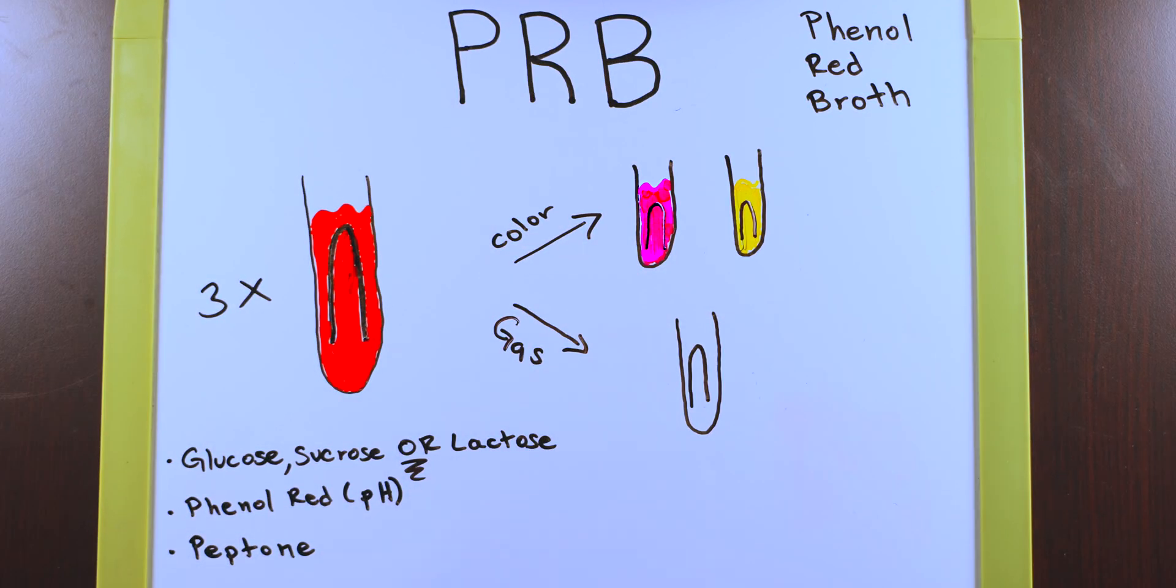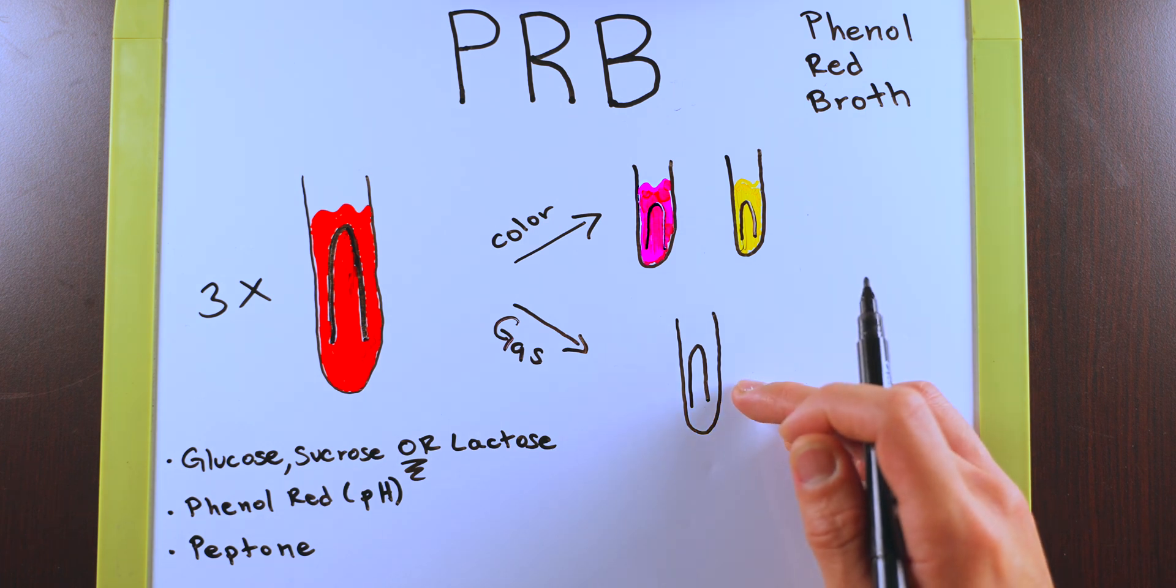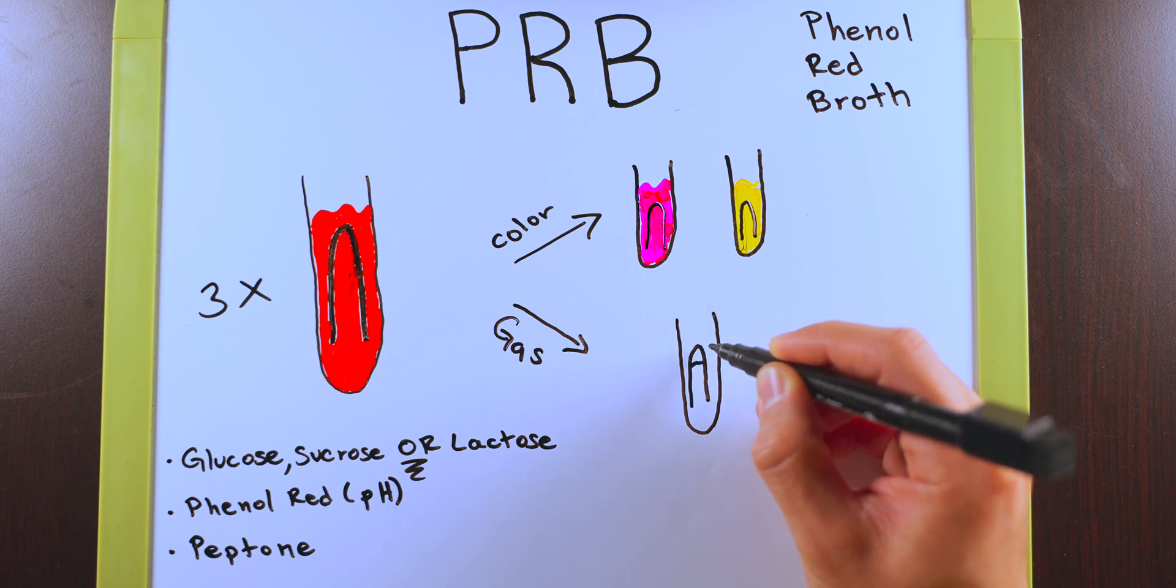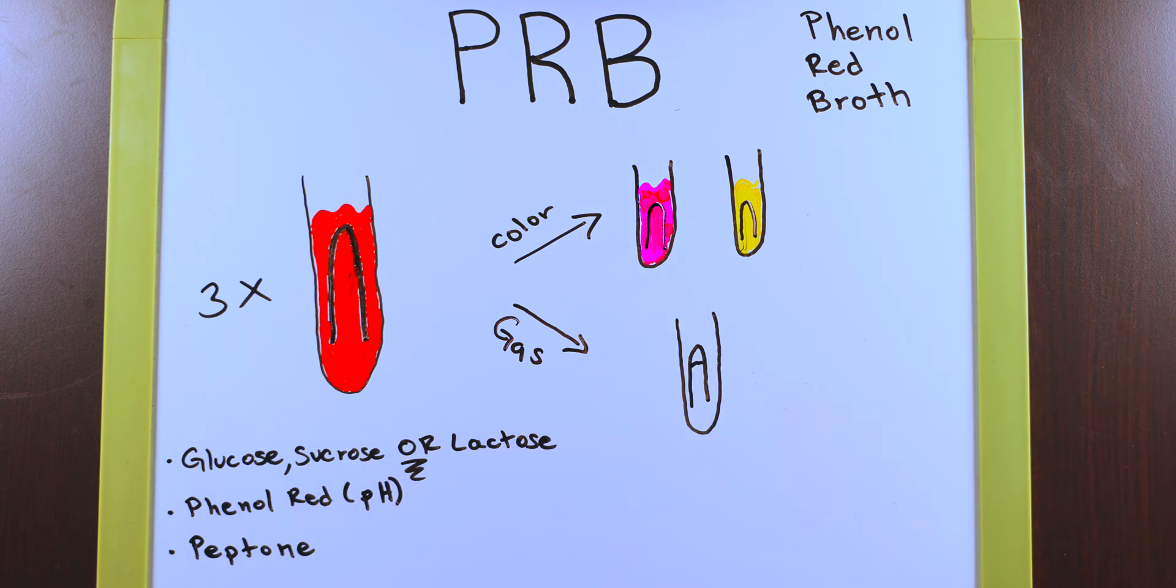You want to look inside the Durham tube of the control as well as the Durham tube in your test results. Is there some sort of bubbling at the top here now or some sort of gas there now that you didn't have before?